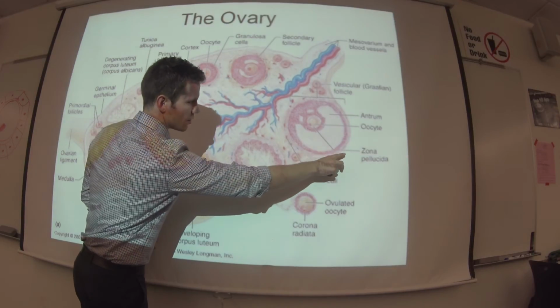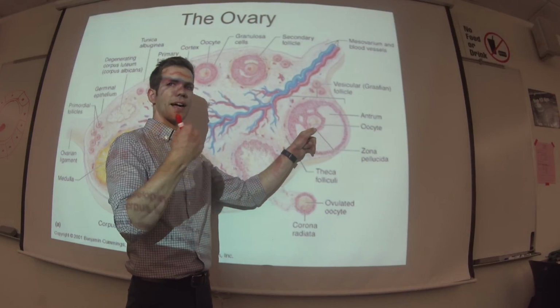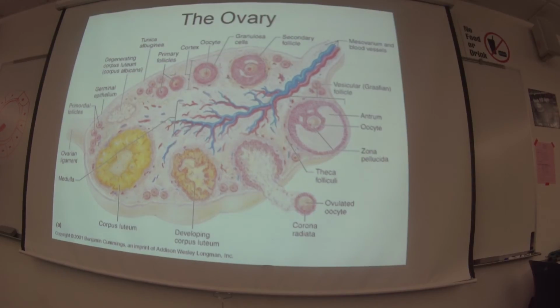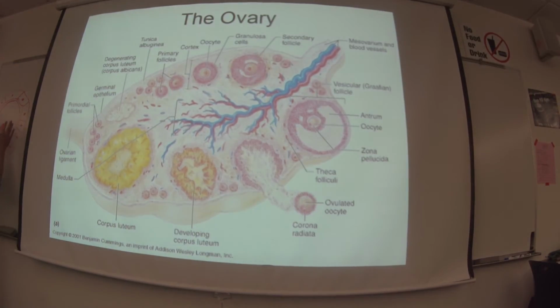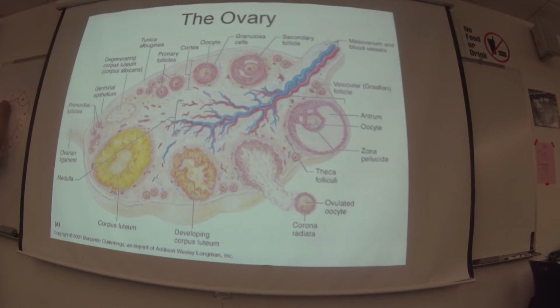And then the second little detailed structure is called the zona pellucida. This one's kind of cool. It's easier to pick out in reality when you're looking at a microscope, but if we go back to this one, let's imagine these cells are now the corona radiata in the center here. And we're just zoomed in at the oocyte here. Well, there's actually a thick protein shell that goes around just the oocyte. And a lot of things are known about this.